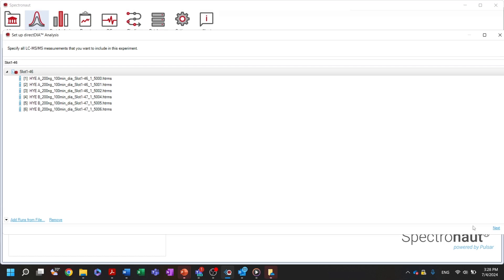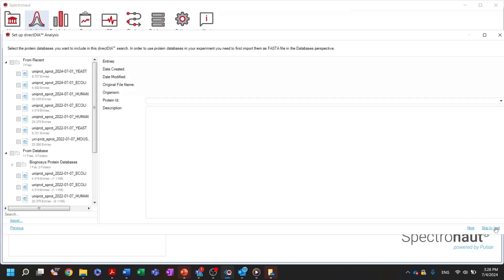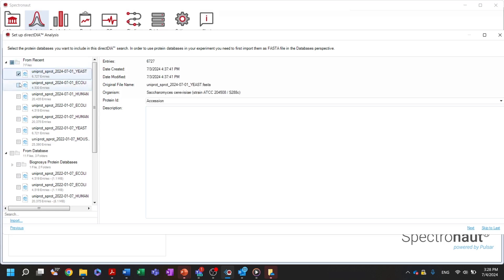Following the wizard, we will select the FASTA files that will be used to generate a search space for the direct search of DIA data. When analyzing multi-species samples, you can select one common FASTA file or separate FASTA files for each organism.